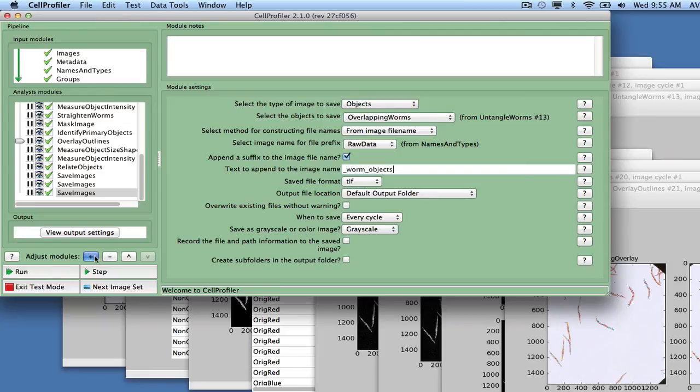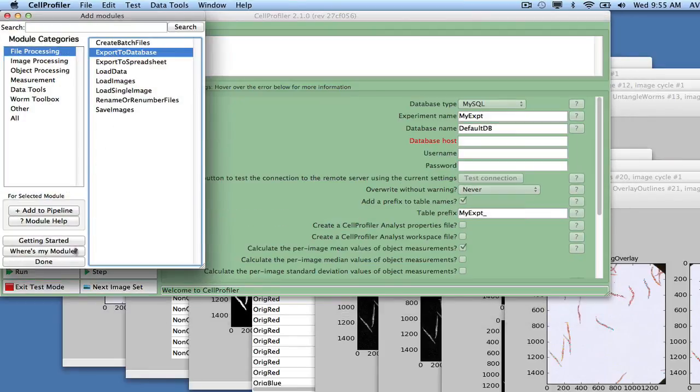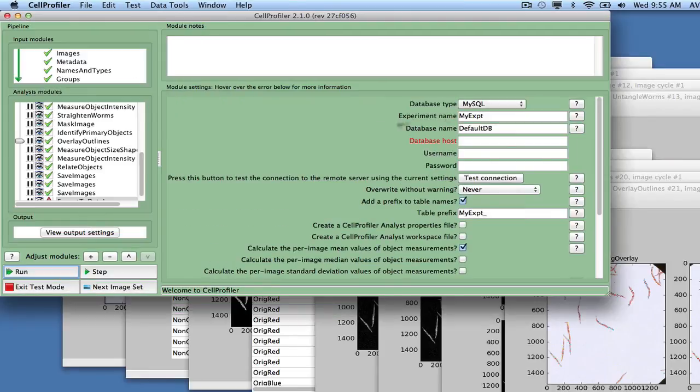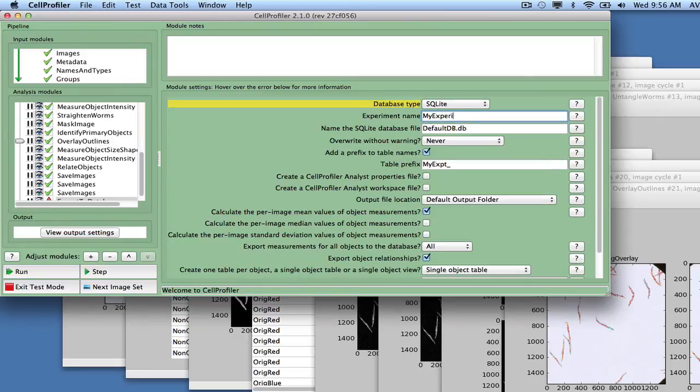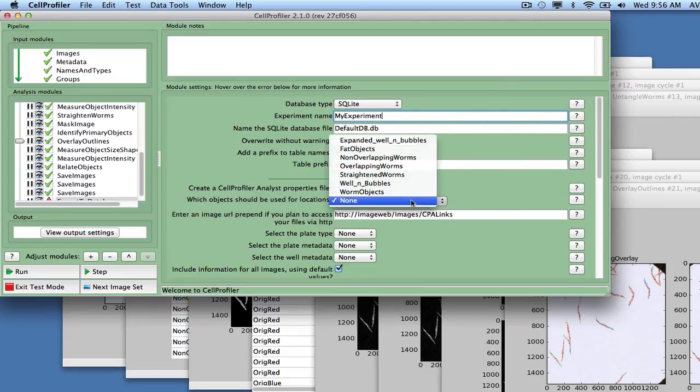Export all measurements to an SQLite database using the Export to Database module. Choose SQLite as the database type, and name the experiment MyExperiment. Check the box to create a CellProfiler Analyst properties file.